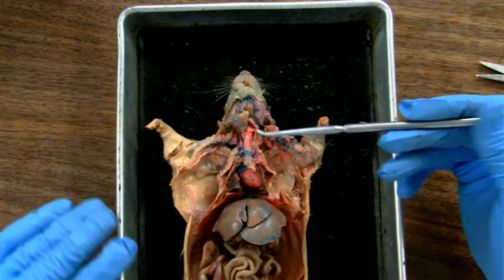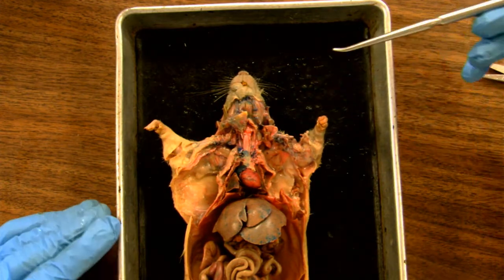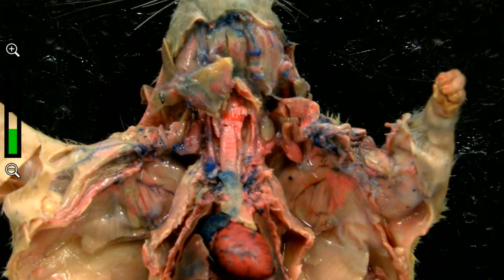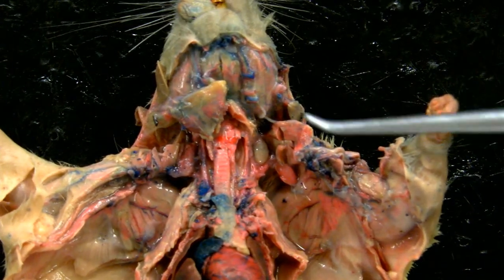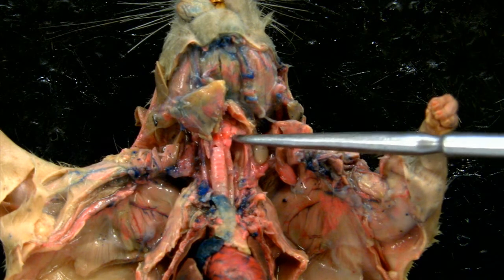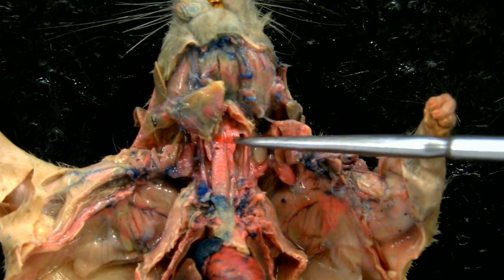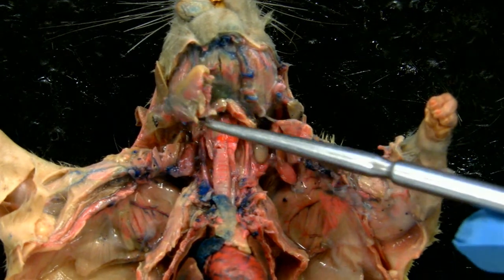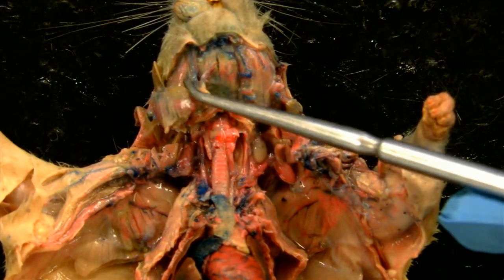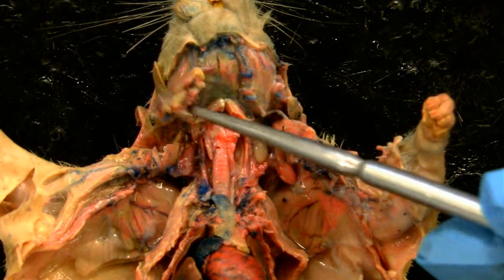I've dissected the throat area extensively, so now I want to show you the glands of the throat. These are exocrine glands. Let's start with a nice landmark — the trachea. That little pink spot at the top of the trachea right there is the thyroid gland. This larger one here that is loose and has been cut — it's not easy to dissect these glands as they're quite close to the surface — this is the submandibular gland. There should be one on either side; this one was removed during the dissection.